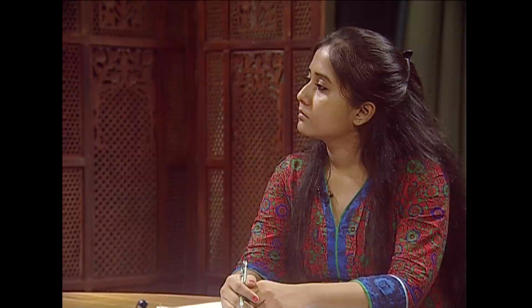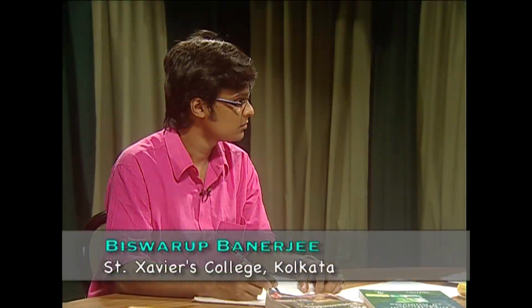So today I will focus only on light microscopy, and a light microscope is an instrument which can be utilized to magnify objects which are not visible to our naked eye. Now, before delving into the details of light microscopy, let me give you a brief on light, especially visible light.